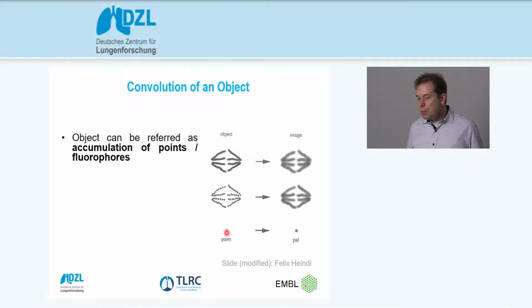Assuming that this is a point source, an infinitesimally small entity, it will always appear larger and blurred in the microscope. This is called the convolution process of the microscope, and it is also limiting its resolution. So we can't see a small entity here. It is always blurred to a specific size, which is also the resolution of the microscope.